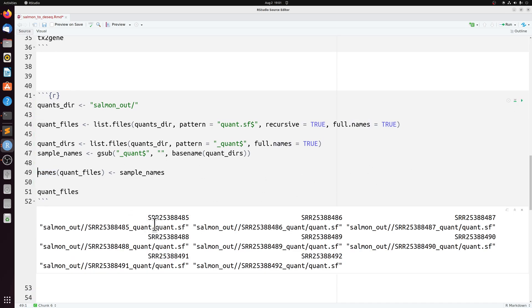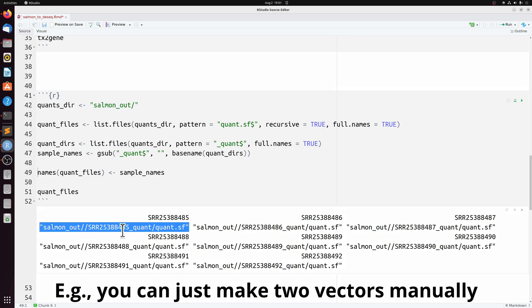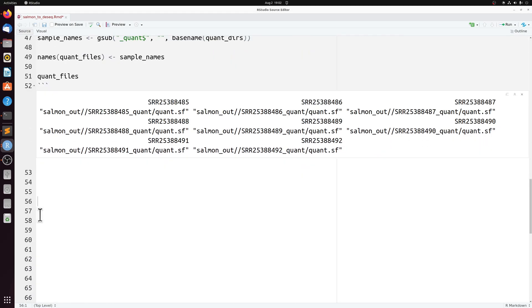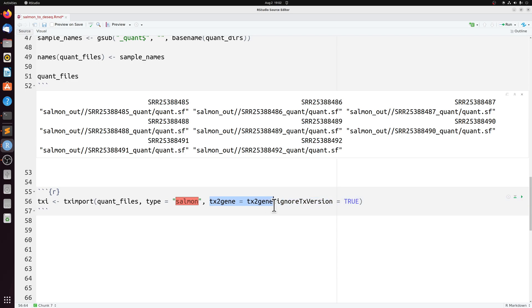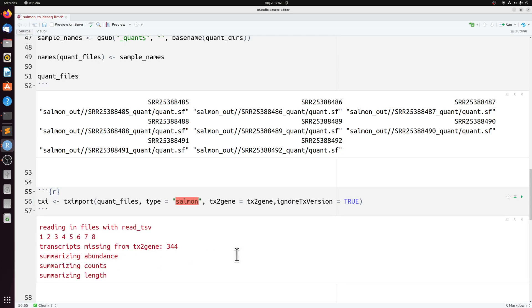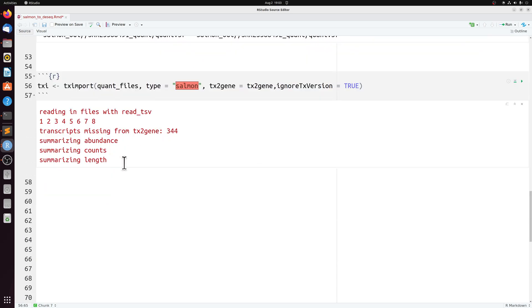And then we're just going to combine sample names with the quant file paths into a named list. And if we look at that, we have the sample names and the paths. So this is what you need. And now we can actually use TXI import, passing that named list we just made, specifying that it's salmon data and specifying that we're doing transcript to gene and ignoring the version of the transcript. So it ignores the dot one or dot two, whatever is after the transcript.